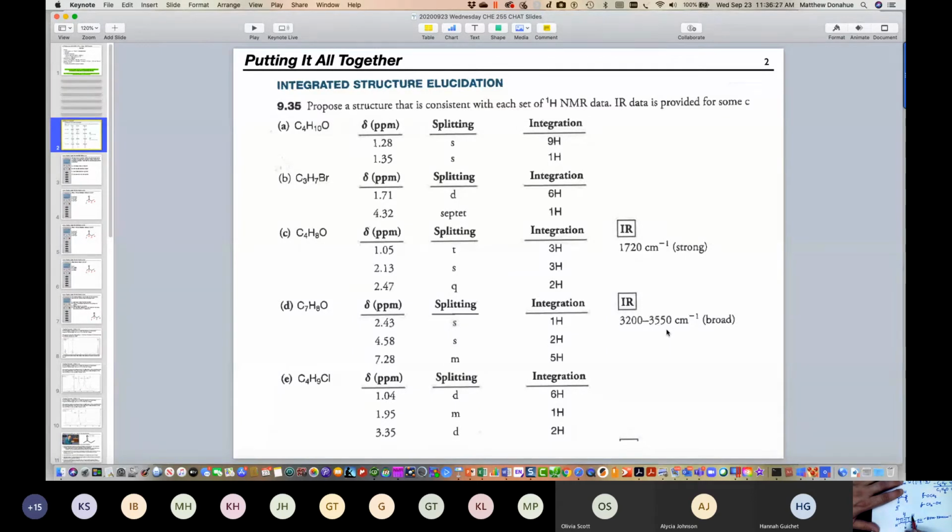So in the 5 here, really these are the same, those are the same, and then this last one is different. So the 5 can really be broken down to 3 sets of 2, 2, and 1. That is a bit subtle, but the reason that you see 5 is just a practical reason based on the instrument resolution.